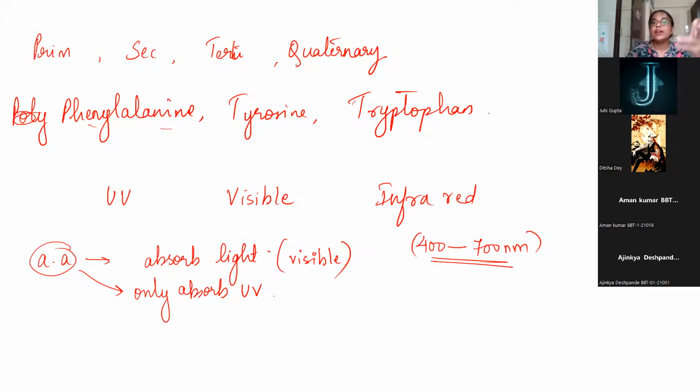And what is spectrophotometry? Spectrophotometry works on the principle of absorption and emission of light and scattering of light. If your particular compound is not going to absorb light, then how are you going to get the further details? Also, if you have all understood the basic structure of, say, atoms.